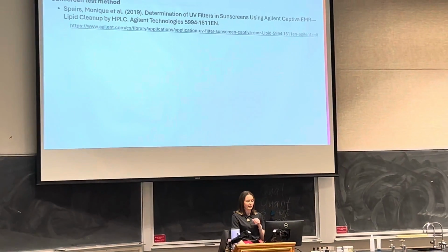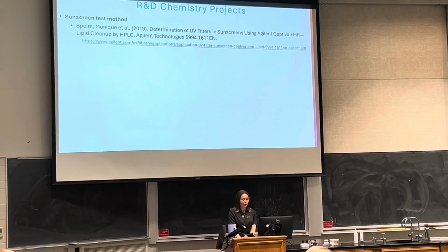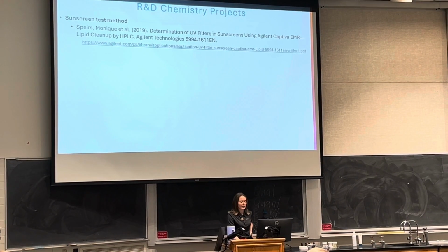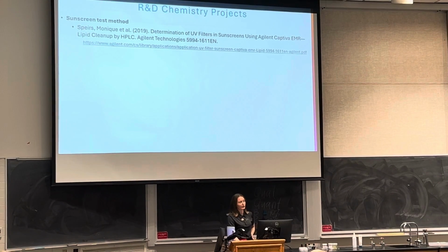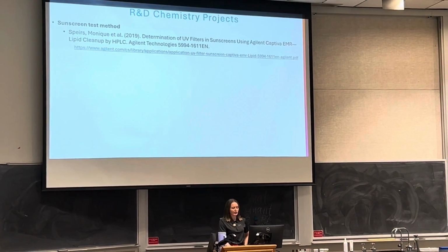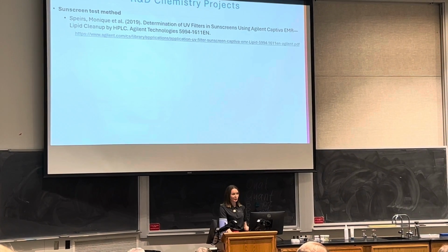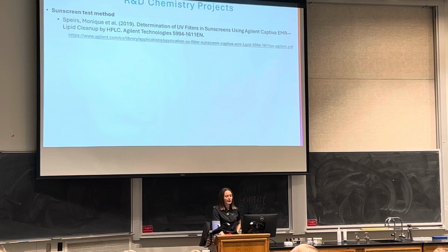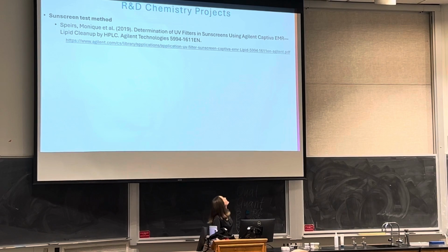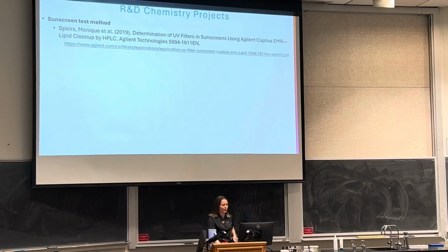I developed a method to test UV filters in sunscreens, and this method has worked for every sunscreen product that we've ever tested it on, indicating high levels of robustness. And it's used to test every sunscreen sample that we receive for UV filters testing in our lab. And I was really blessed with the opportunity to collaborate with Agilent Technologies, the company that designs and produces the HPLC systems that we use for this testing, to publish this method. And it's available on the Agilent applications library so that other people can use it to support their method development.